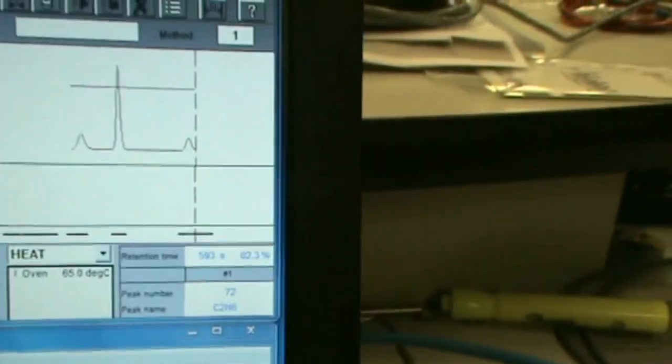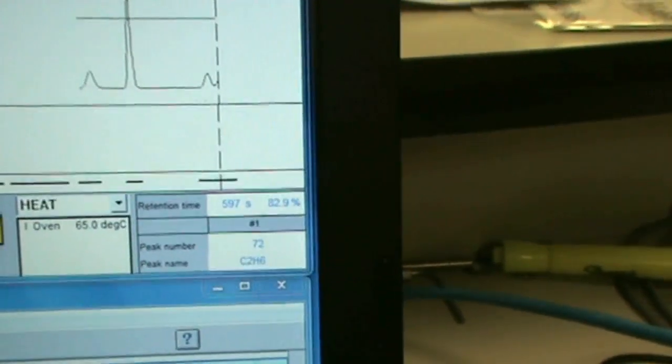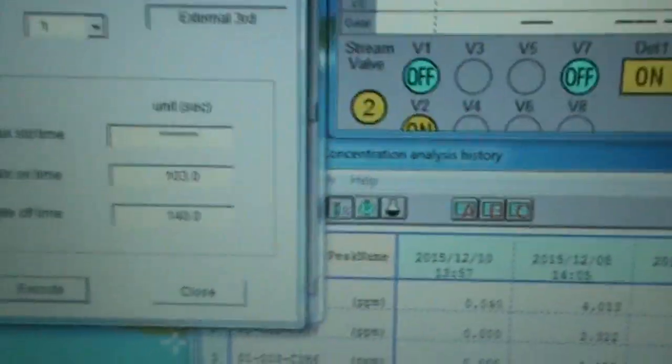So again, let's go back up here. Well, we had to restart the chromatogram, so we lost the front end of our chromatogram. And where are we at? We are at 82 with 596, 597. So what we would do is we'd write down all of our gate timings and decide if we want to change any of them, and zoom in and make those changes.